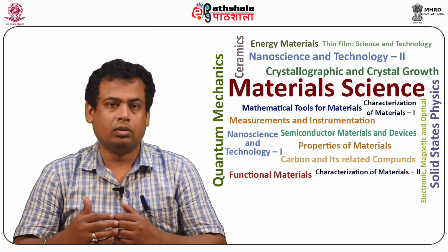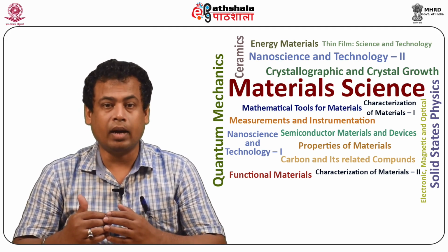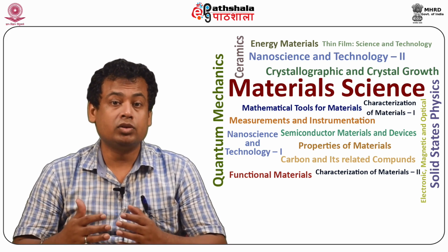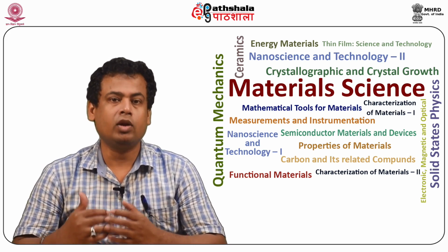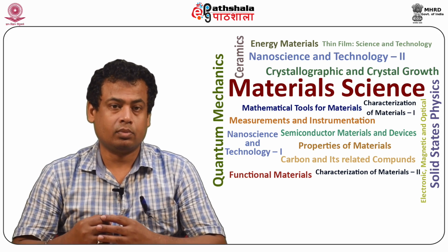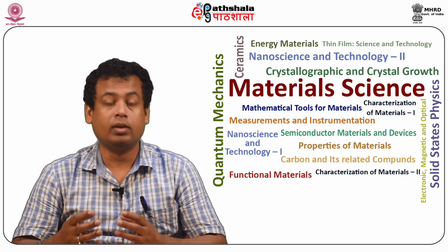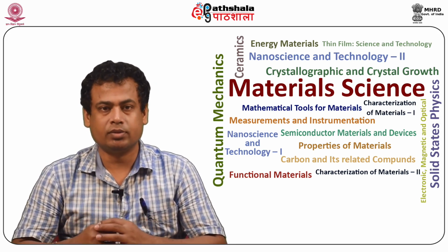The filament consists of a fine pointed tungsten wire, ideally one atom across the tip, that is kept at a high negative charge along with the rest of the cathode, while the anode is kept at a positive charge. The large difference in potential on a small point pulls the electrons off the filament.